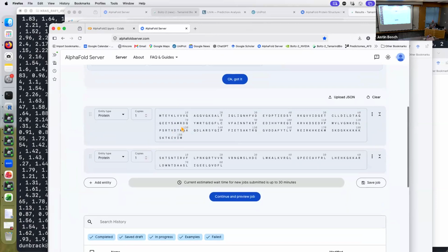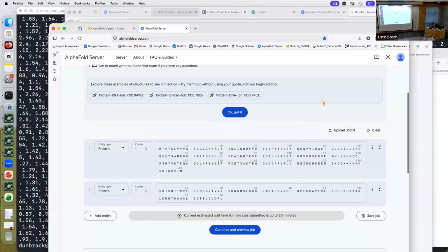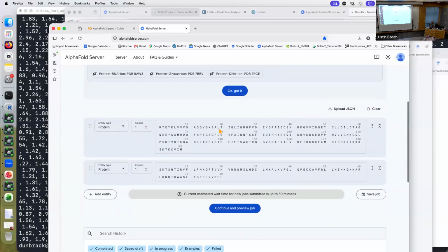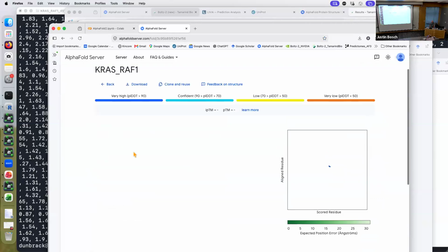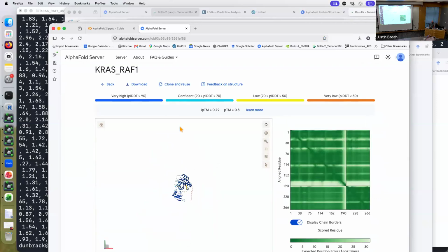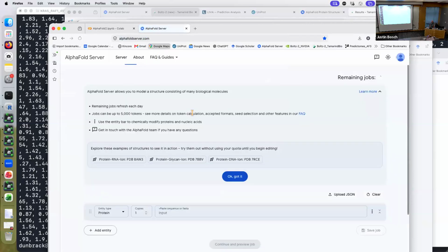So when you go to the, I'm going to clear it. Clear button does not work. Oh, it doesn't matter. So I have copied. So, oops. All right, I need to just get a new job. Okay. They introduced a bug to the web page recently. It's really annoying.